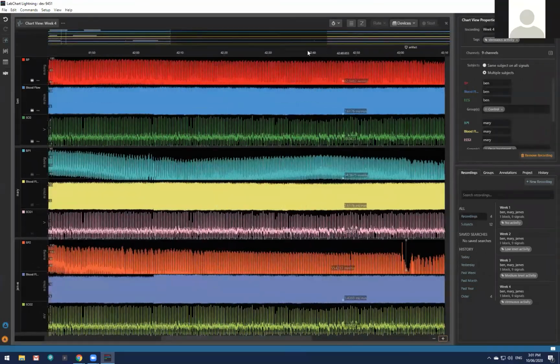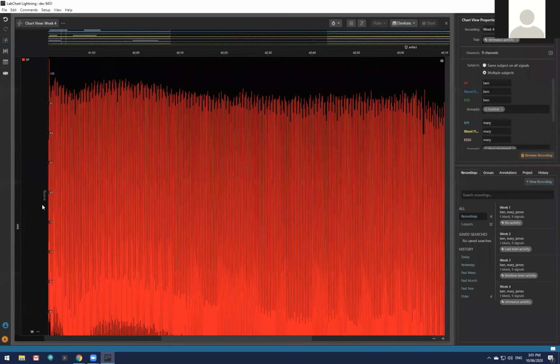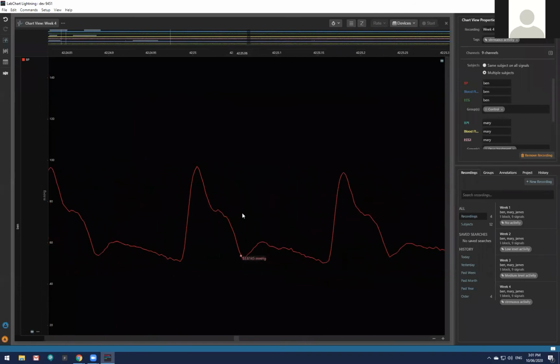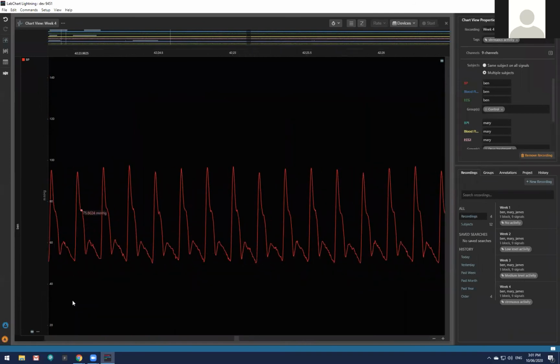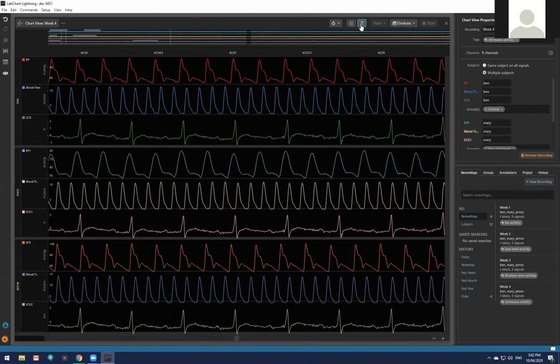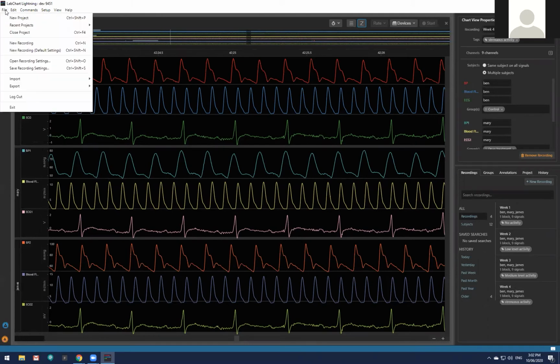So at any point, I can look at this file in this particular signal. I can zoom out, and I can zoom right in there if I want. That's really simple to do for me. And then I have the option to make this back to its original position and auto scale everything. So what we see here is, once again, an element of simplicity. The options here are fairly simplistic.